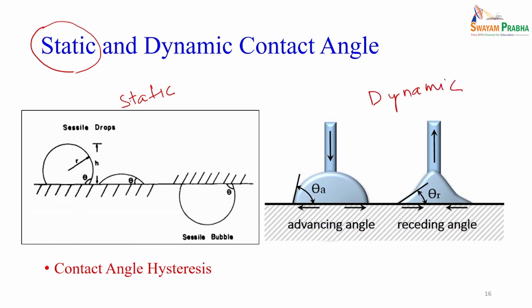There are two things we can see. First, we can see how theta is changing with time. Theta will keep on decreasing if you capture the image at different time intervals. Theta changes up to here, and this is because of the equilibrium.